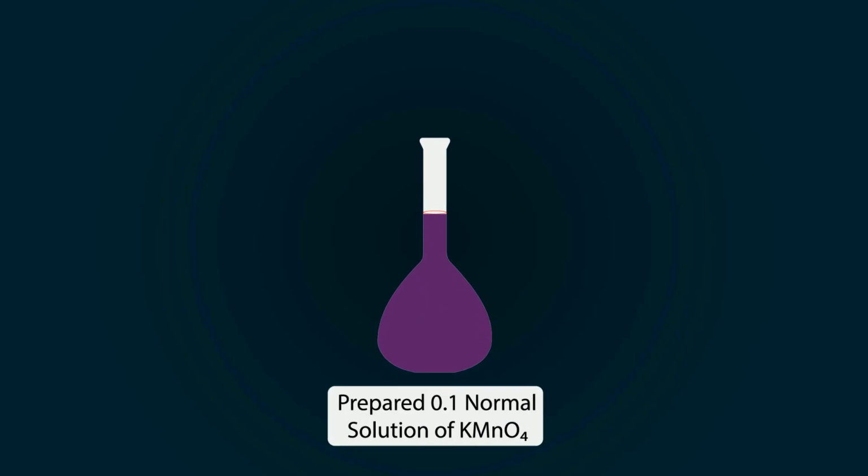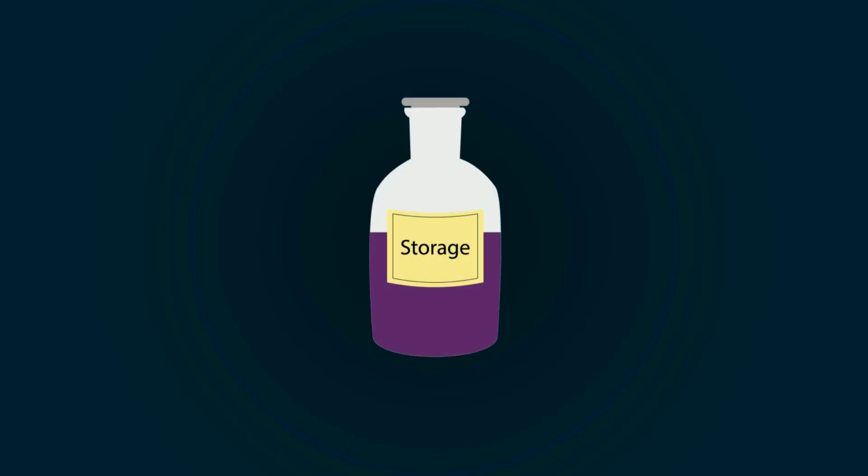and you have successfully prepared 0.1 normal solution of KMnO4. You can store it in any bottle you want.